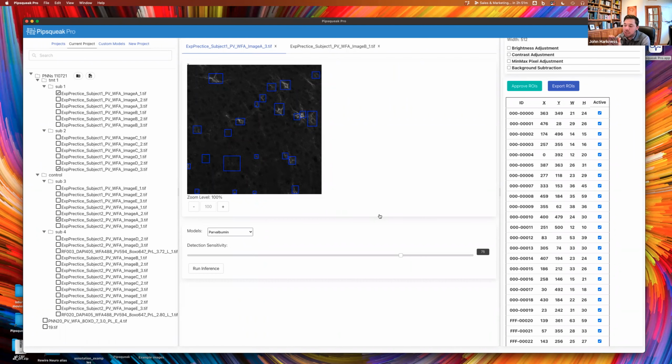But that really isn't required if you are coming in with a single Z step, or maybe an image from a fluorescence microscope, a bright field scope. You're not going to have that Z plane, and so that's totally fine. You can bring that in and analyze just a single plane, but I think for confocal, a good approach is to sum that Z stack.